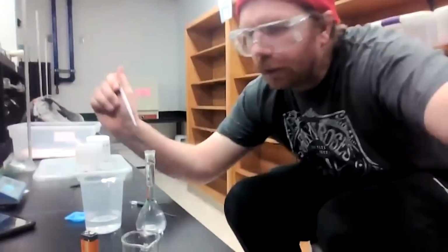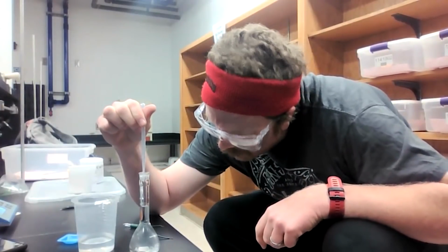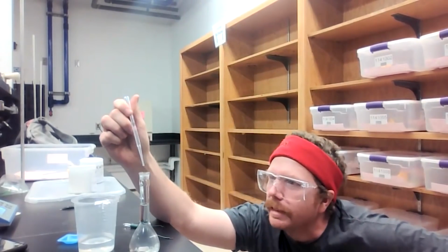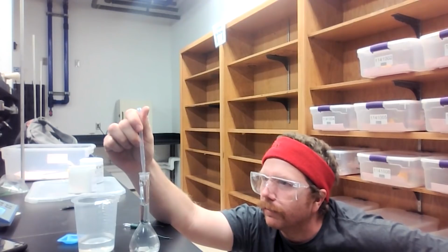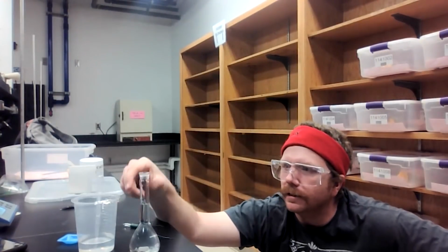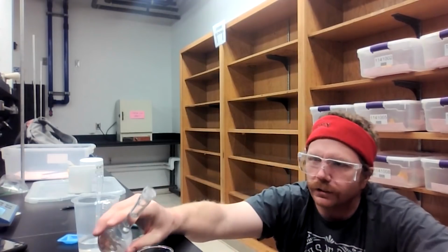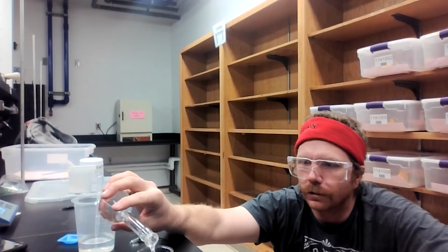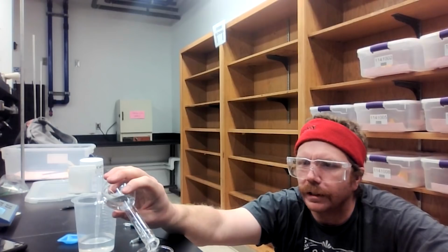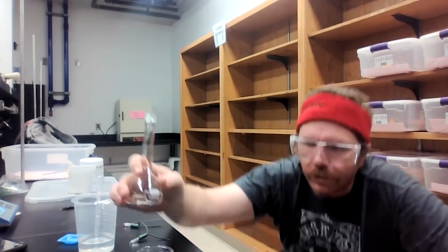So now what I'm going to do is I'm going to transfer water. I want to get it down so that I can see the bottom of my meniscus. I think that's one of the, it's like everyone's favorite science word. So the bottom of my meniscus is perfectly in line with my etched line. So now I'm going to transfer my sodium chloride solution to my kind of experimental beaker. Okay, I've got 100 milliliters of the solution now in my beaker.